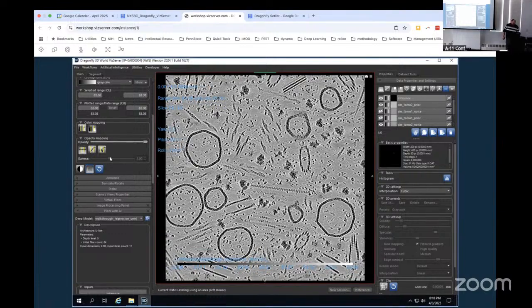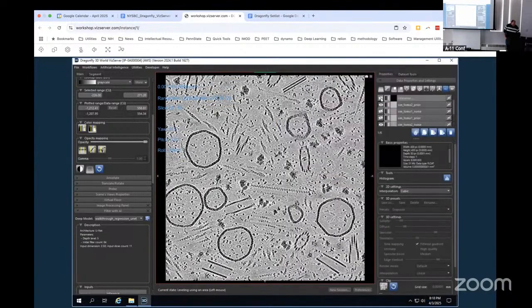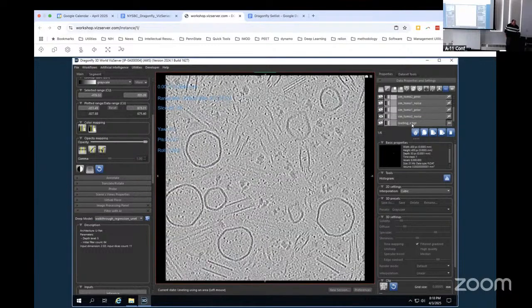The data's there. Yeah. And so if you look at this, let's turn on, so we have this, and I'm switching right now between the denoised and the original ground truth. You can see a slight difference. The ground truth is actually a little bit noisier. It actually seems to denoise more. But it certainly does a good job at making it look like the synthetic tomogram.